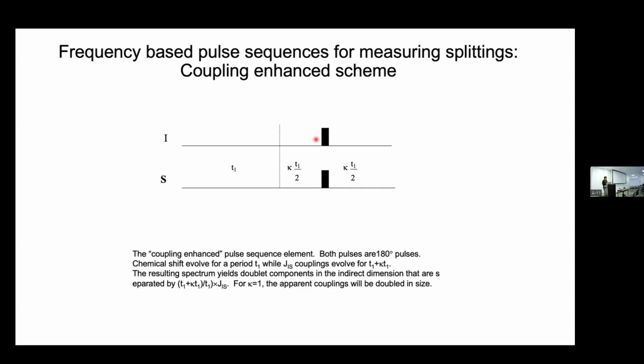Yes. So how does that differ for my situation? I have chemical shift T1, J coupling is 2T1, versus chemical shift T1, J coupling is T1. How does the spectrum differ in appearance when I Fourier transform it?